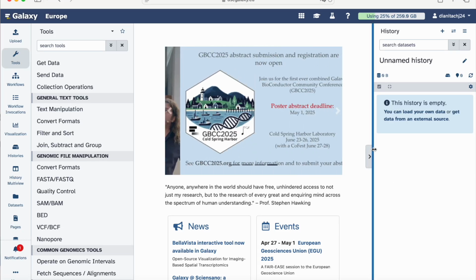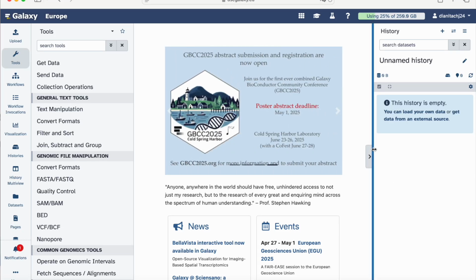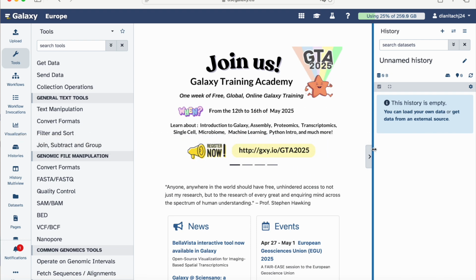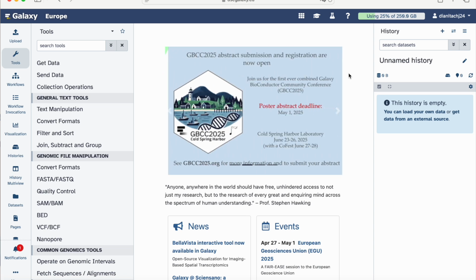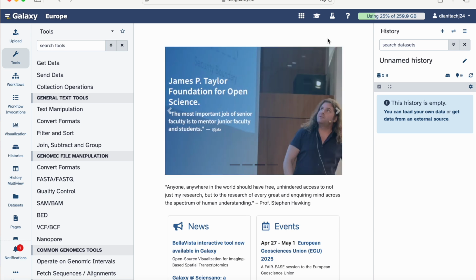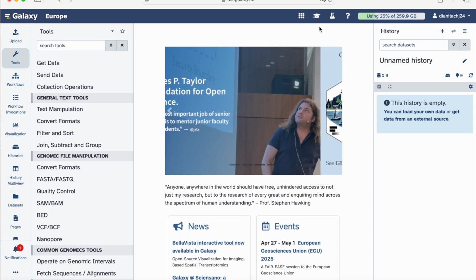Welcome to the video tutorial for Pseudobulk analysis using tools like Decoupler and EdgeR. My name is Diana and I will do the hands-on part of this tutorial in Galaxy together with you in this video so that it is easier to follow when you are self-learning at home.